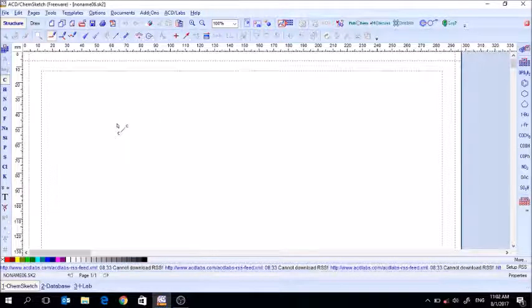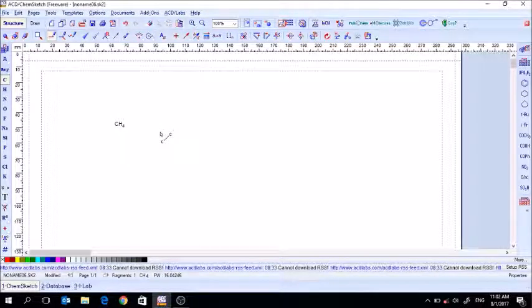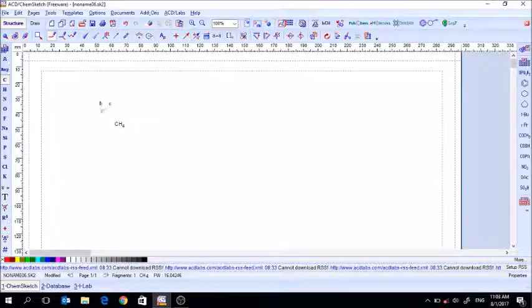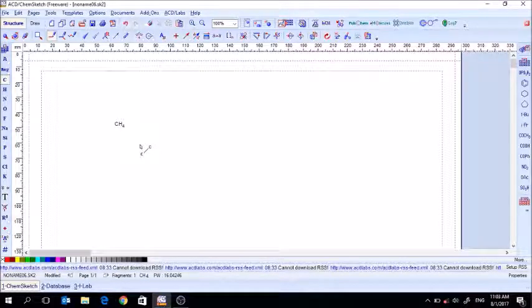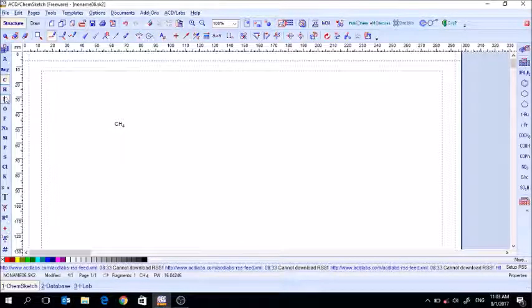When you add a carbon, it doesn't just add carbon — it adds carbon and four hydrogens. With non-metals, if you remember from chemistry, non-metals form a certain number of covalent bonds. Carbon normally forms four covalent bonds, so ChemSketch automatically fills those four bonds with hydrogens. It does that for all non-metals.